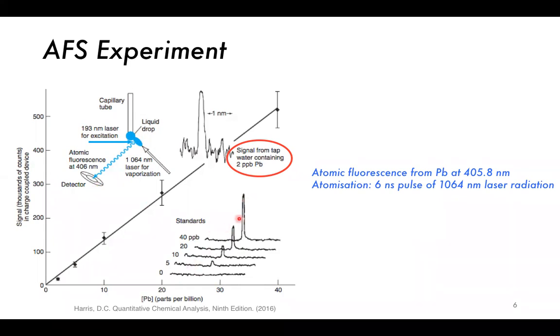And then we have here a bunch of standards which have their signals. So 0 ppb, 5 ppb, and so on. We see this peak, which corresponds to our lead. And so here's the signal from tap water containing 2 parts per billion lead.